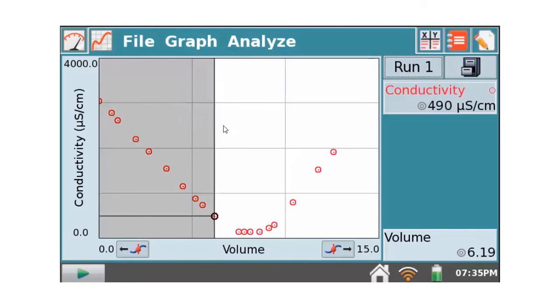If you don't recall how to do straight line stuff on here, you drag over the part of the plot you want to analyze. You go to Analyze, Curve Fit. Click on Curve Fit, click on Conductivity.